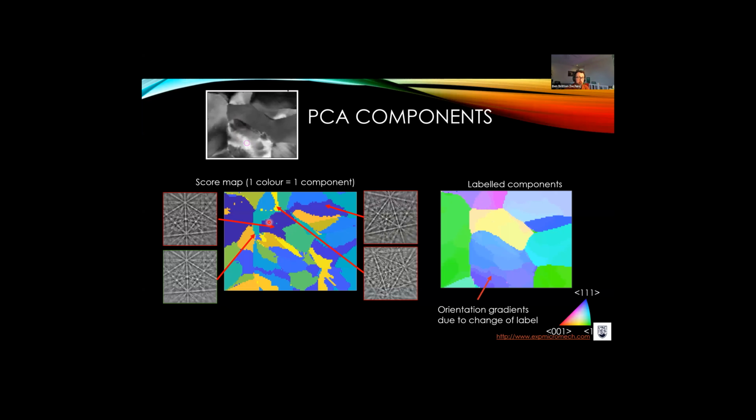It looks kind of like our microstructure. This is kind of a backscatter type image. It looks like our microstructure, but we see, for instance, there are multiple regions with common diffraction patterns, although they're just shifted. They're shifted by at least a pixel, so they look significantly different to our statistics. Fortunately, however, we can then take this 30 signal data set of the diffraction patterns and use pattern matching to identify the crystal orientation and phase. So we've converted effectively 9,032 diffraction patterns to 30 problems where we have to solve the crystal structure.